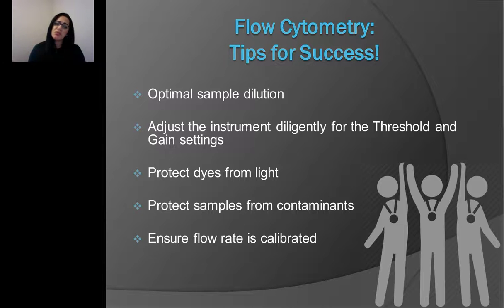You have to make sure you protect your samples from any contaminants, because this instrument is super, super sensitive, and it's going to pick up anything that you load in that sample tube. So basically the instrument will do whatever you tell the instrument to do. And therefore, having great aseptic techniques really, really helps and takes you a long way.